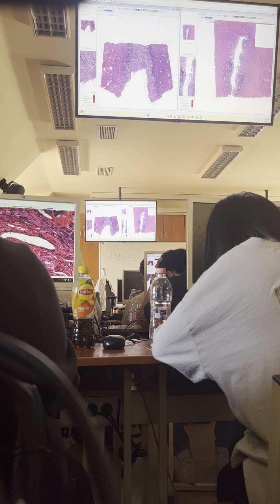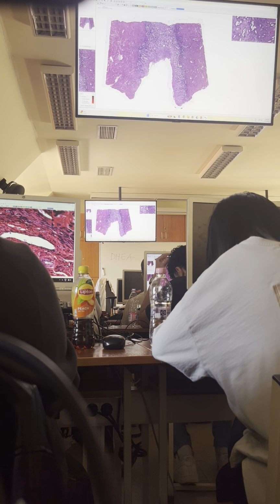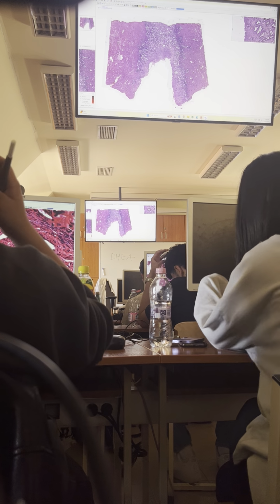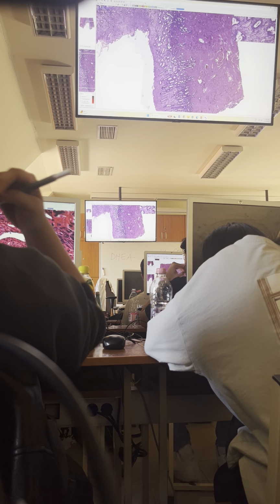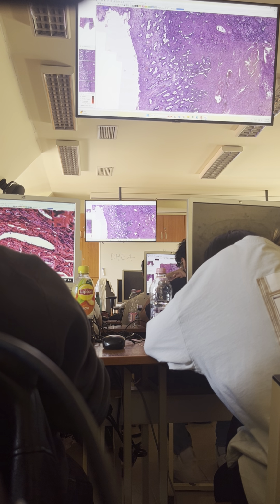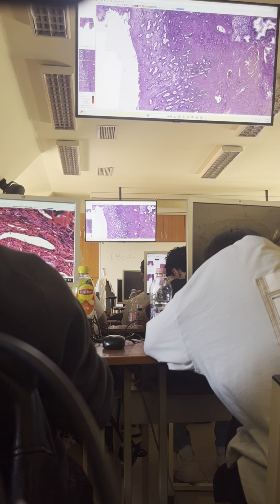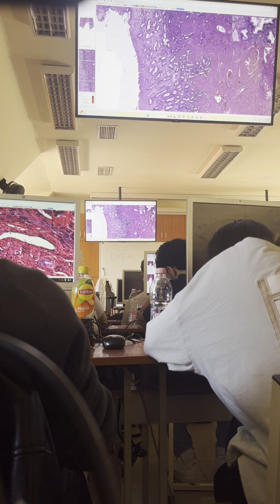So let's magnify this progesterone phased, or also called secretory phased uterus. So first of all, we can distinguish the basal layer, or stratum basale, from the functional layer, or stratum functionale, just like before.